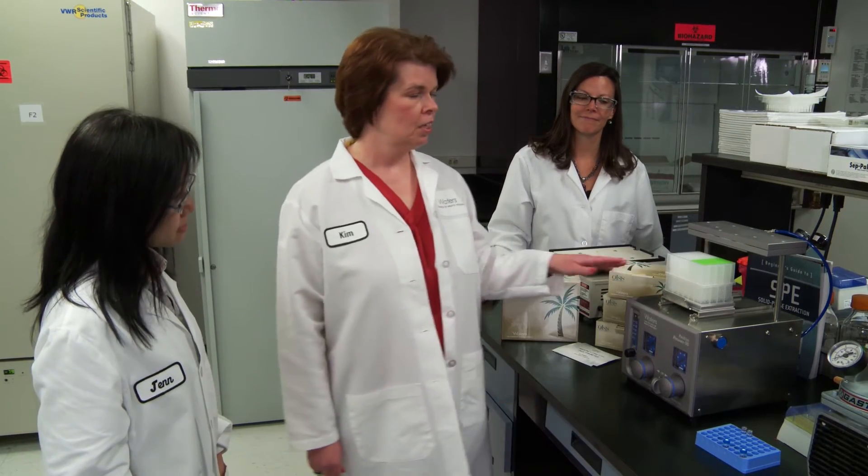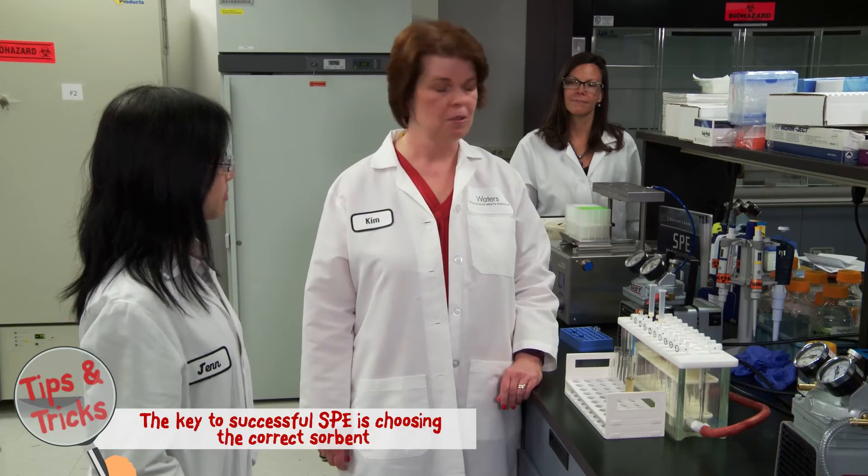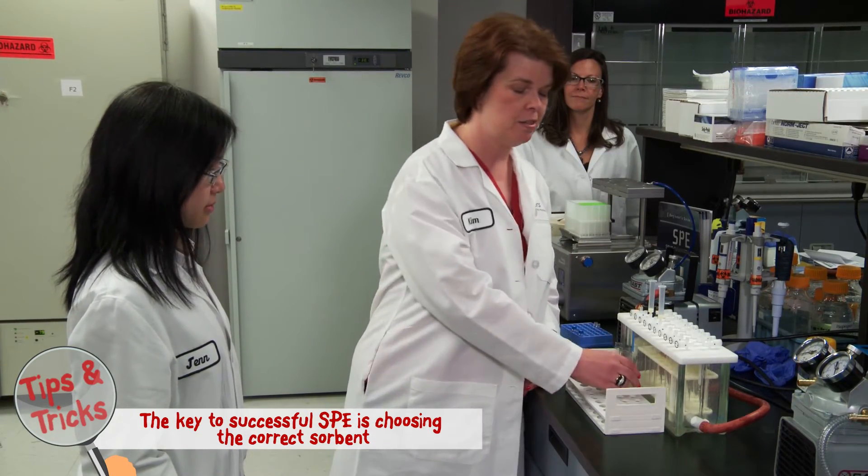However, Jen, before you do solid phase extraction, there are a couple of important considerations. For example, here we're going to work with a positive pressure processor. Now with some sorbents, if they're not water wettable, you have to do a condition and equilibration step to get them ready — that can take a lot of extra time. And here we're looking at a 96-well plate with a vacuum manifold. Again, the sorbent choice is really important. If you're working with a sorbent that isn't water wettable, it can start to dry out during processing and you might get reproducibility issues with your sample. If the sorbent dries out, it's not going to work. And here we're using a 20-position vacuum manifold with some SPE cartridges. So it's important again to choose the right sorbent, because you can go through the entire SPE process and still wind up with a dirty sample.